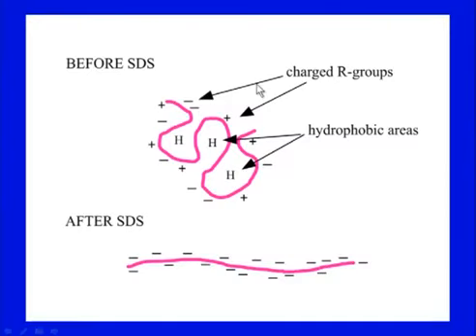So, you are essentially separating on the basis of size. A protein is folded, it has interactions, hydrophobic areas, other charged groups, hydrogen bonding, all those things. Now, when you treat it with SDS, the protein is extended and overall covered by the negative charge. Proteins which have different shapes are now extended molecules, and heating also helps in that.